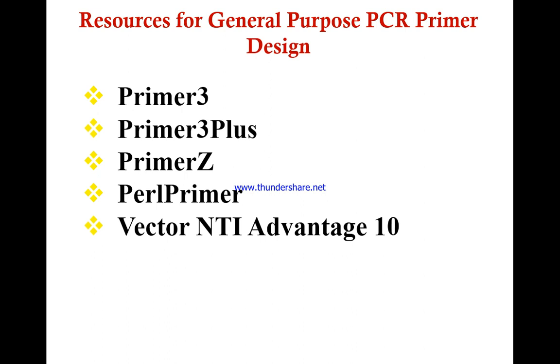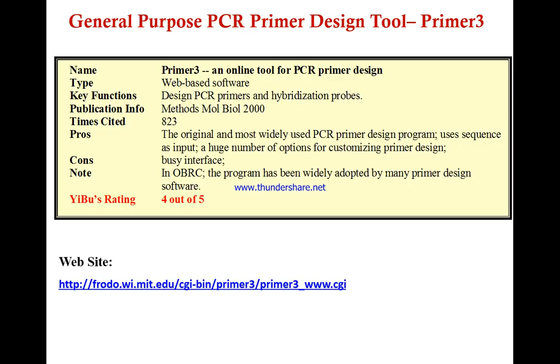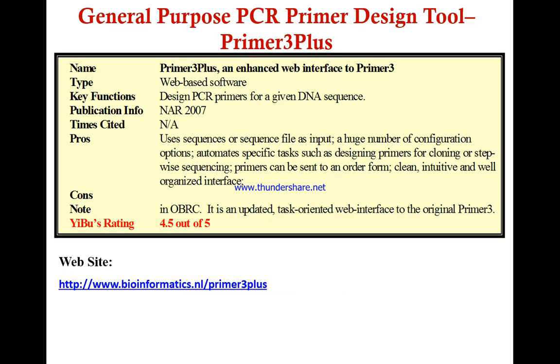There are some sources on the internet on which we can design our primer first to avoid any problem in future: Primer3, Primer3 Plus, PrimerZ, PerlPrimer, RTPrimerDB, Vector NTI Advance 10. These are the names, and website links are present below.